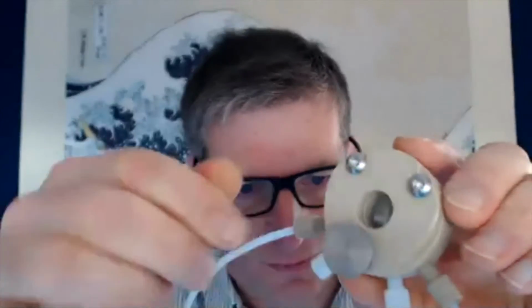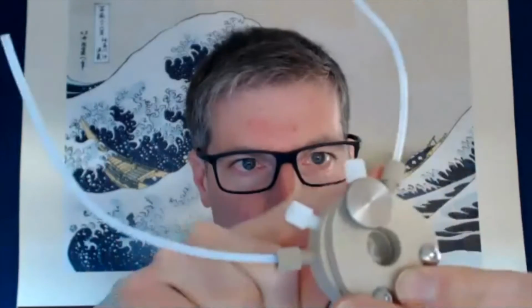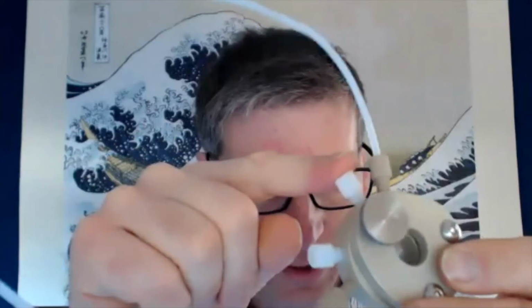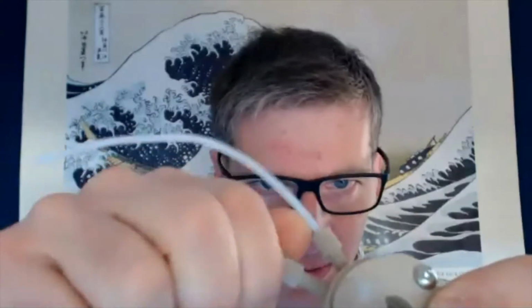They're rated to tens of bars of pressure. I think we say about 7 bar is safe, but obviously there's an upper limit above that. It's got ports on the side. This is just set up with 1 input and 1 output, and there are 2 stopper ports in here. But again, it's very easy just to take these out. There's another pipe there, so that's now got 2 inputs and 1 output.